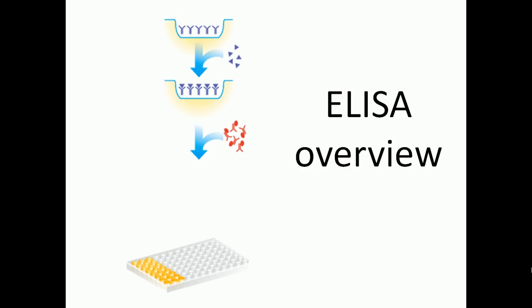After that, the second and most important part of the reaction is to add another type of antibody which is again specific to those antigens, but this time the antibody has an enzyme linked with it. For example, these are again red Y-shaped antibodies, but they are attached with some kind of circular red dots, and those circular dots are nothing but enzymes. Now these enzymes can interact with a particular type of substrate to convert that substrate into a colored product which we can visualize.